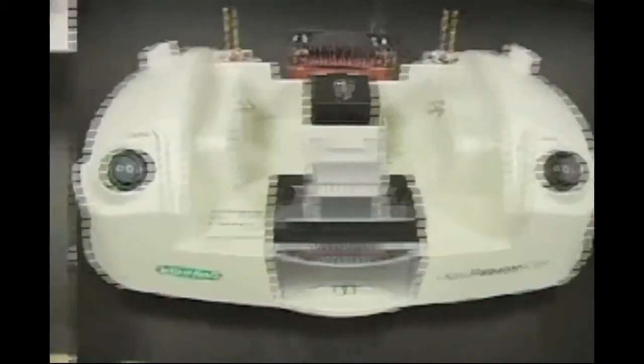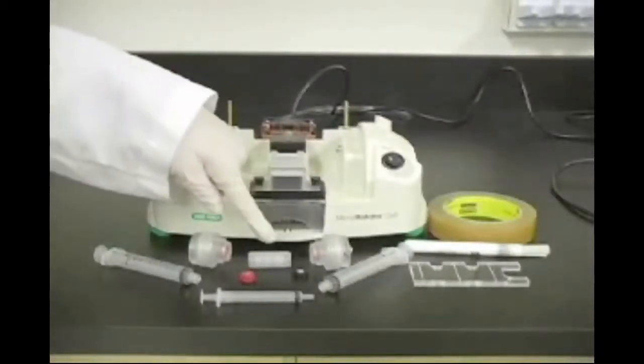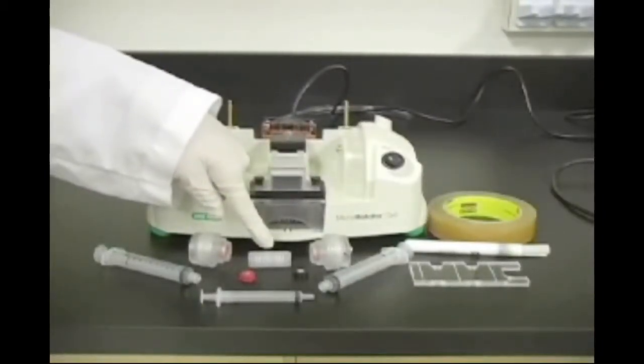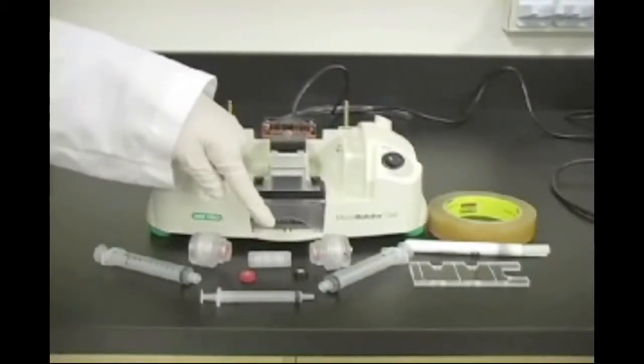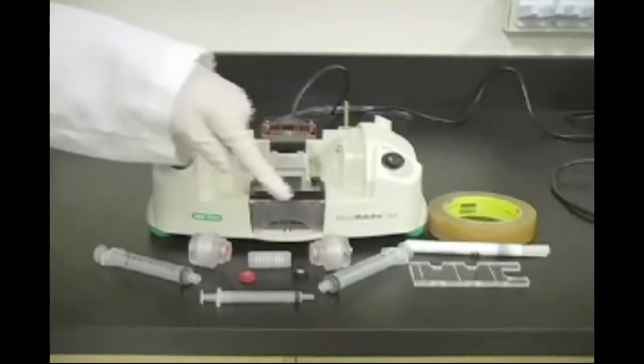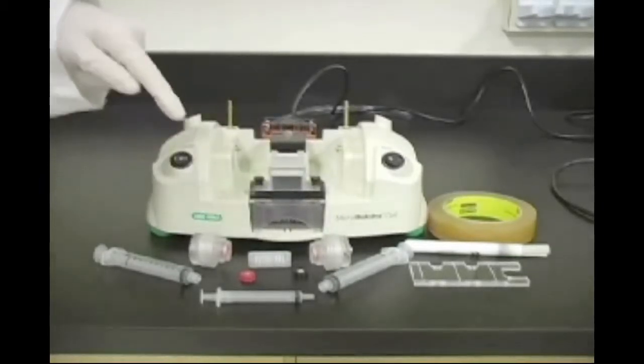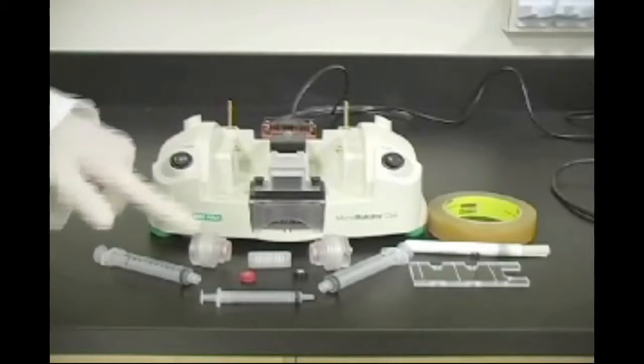The focusing assembly consists of a focusing chamber that is attached at both ends to electrode chambers that hold the electrolyte solutions and provide electrical contact between the focusing chamber and the power supply.